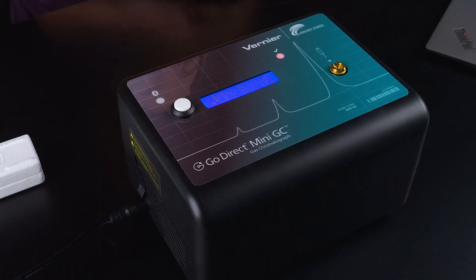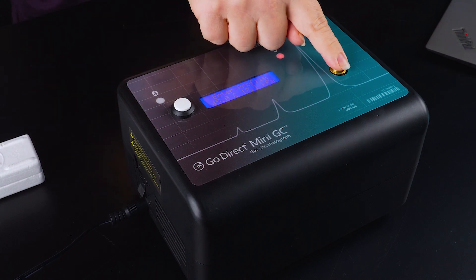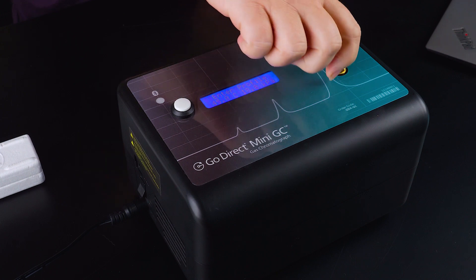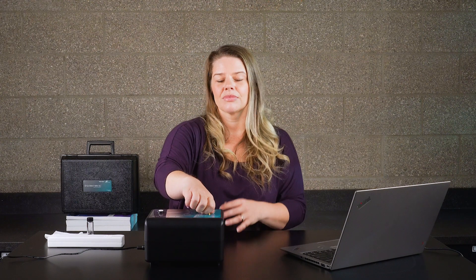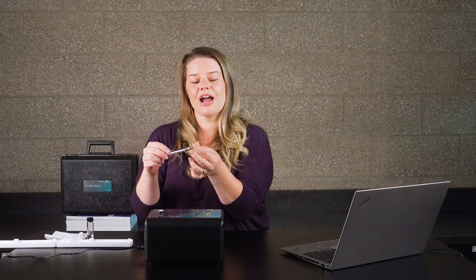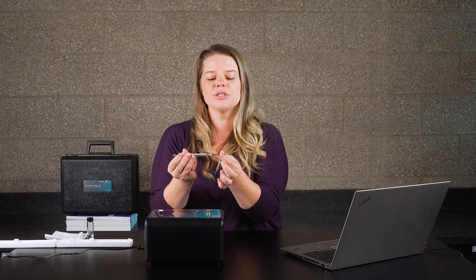The injection port is right here. You are injecting directly into the column through the septum. The septum is accessible by unscrewing this port. With your purchase, you get two additional septa that are included, as well as a one microliter Hamilton syringe. This syringe has a brown bumper on it that you do not want to remove — it helps the syringe tip from going too far into the column.